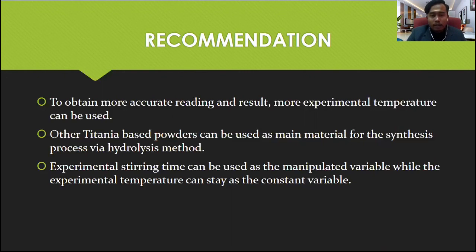Then other titanium-based powders can be used as main material for the synthesis process via the hydrolysis method. For this experiment, we only use titanium sulphate as the main material.